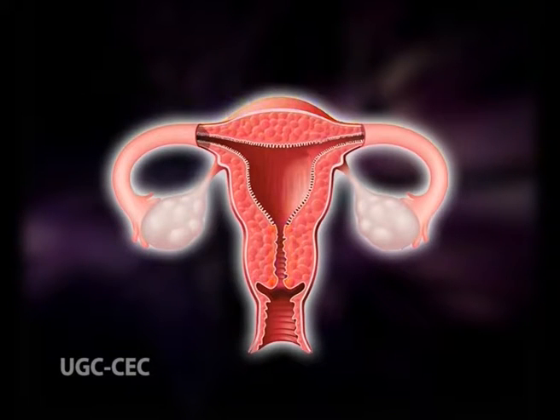Uterus. It is a muscular female reproductive organ. It consists of an upper expanded part, that is the fundus, and a lower narrow part, that is the cervix. It is commonly referred to as the womb. It is a pear-shaped organ about the size of a clenched fist.